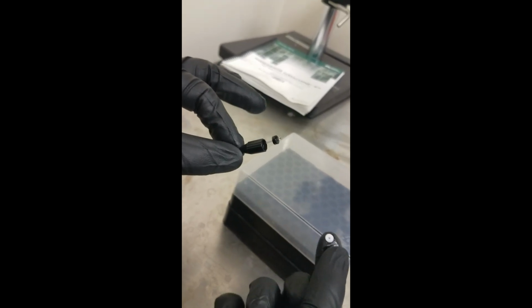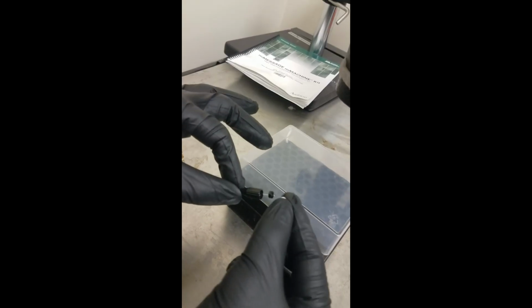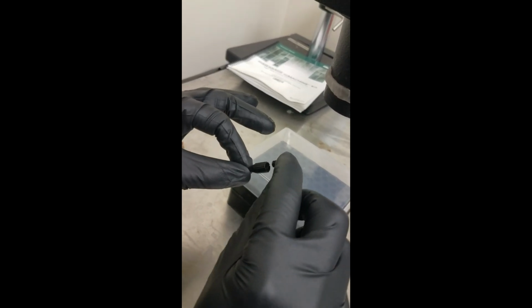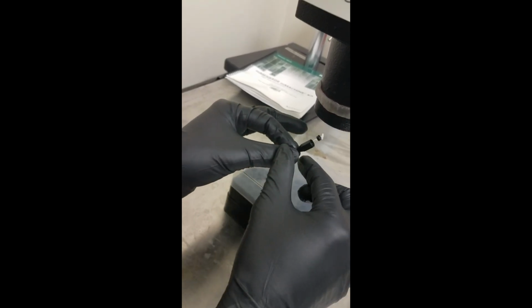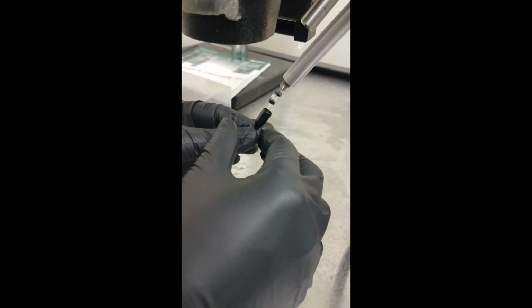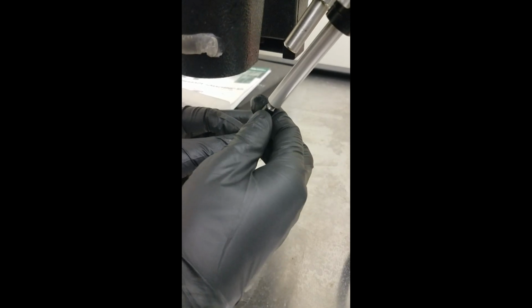And then you take the white piece, and the white piece has a hole on one side that is big and on one side that is small. The big side goes on top of the glass tube, and it just sits on top of that, just like that. And then the small piece fits around the plunger. And so all 3 go on, then you can push this piece up and screw it on.